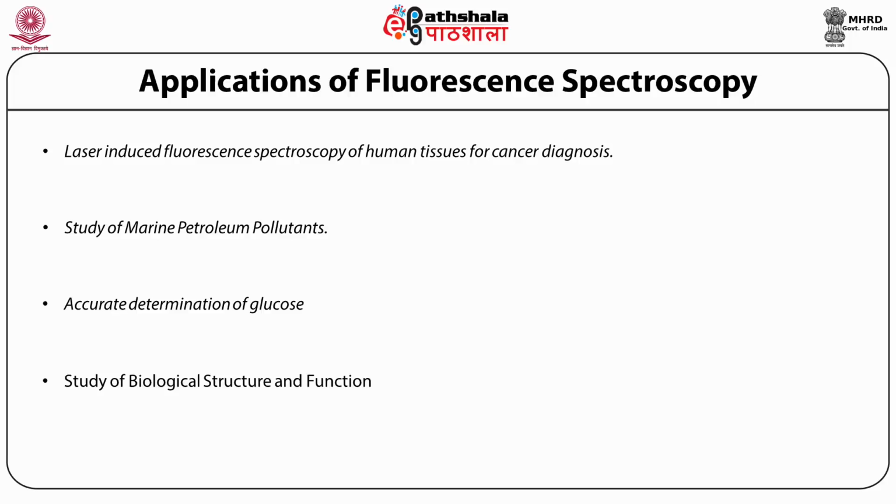The protein domain structure and motion on the subnanometer scale can be spectrally monitored using fluorescence resonance energy transfer, generally termed FRET, which is a non-radiative process where the energy is transferred between two fluorophores.